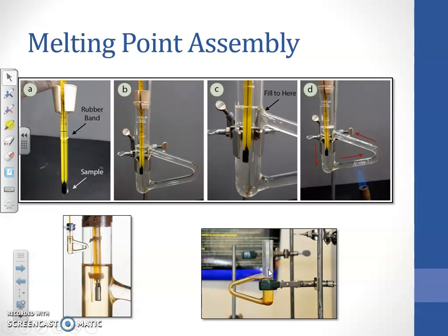What happens if you wash this Thiele tube? Moisture will remain in the Thiele tube, and that will come out during the experiment with the heated liquid paraffin, and that causes the tube to burst. The tube will burst, and all the heated liquid paraffin, the heated oil, will be exposed to the person performing the experiment, and that is hazardous. Heated oil is exposed due to the bursting of this Thiele tube.